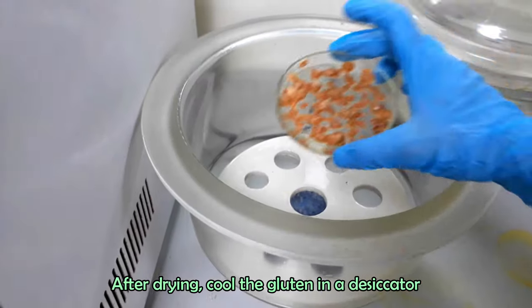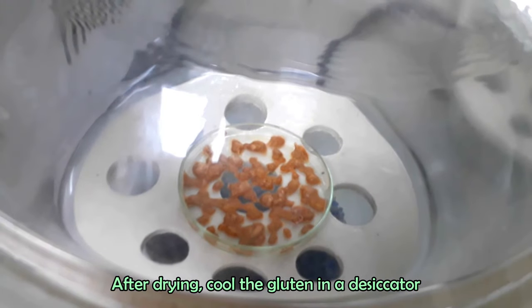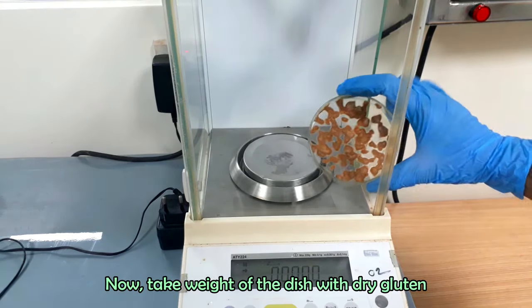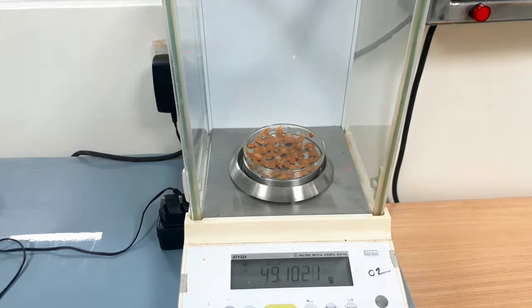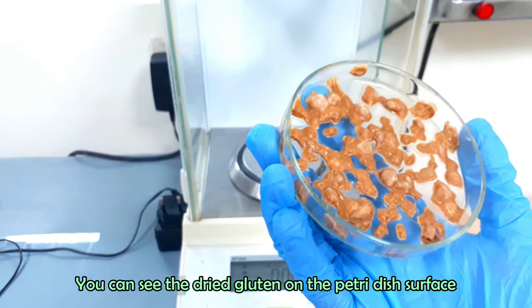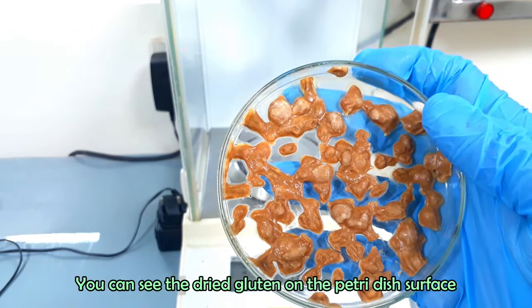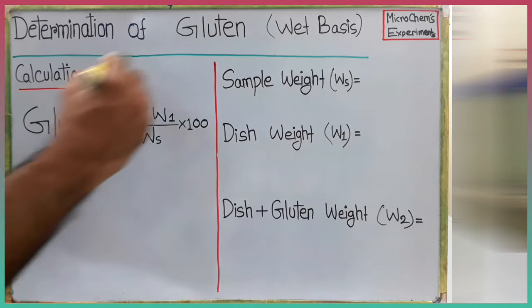After drying, cool the gluten in a desiccator. Now take weight of the dish with dry gluten. Note the weight. We are in the last step. Let's put the known values in the right side of the board.